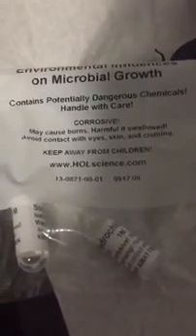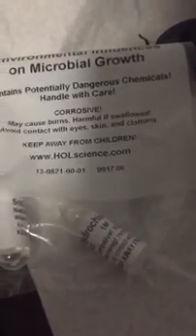We have our HCl, hydrochloric acid, and then we have our sodium hydroxide, which I believe I researched is lye, and it's an alkaline solution, while the hydrochloric acid will make the broth more acidic, while the sodium hydroxide will make the solution alkaline.